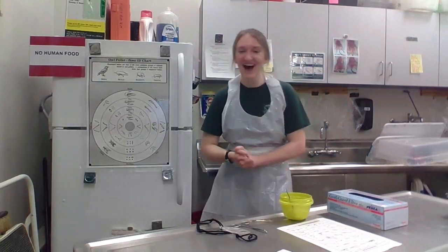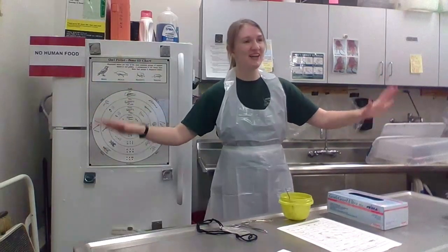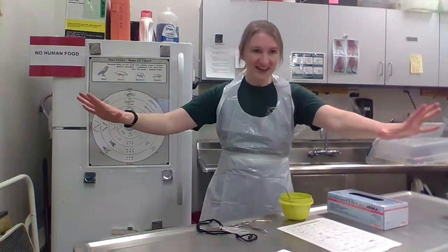Hi, thank you all for being here today. What a great audience. Welcome to the Raptor Center Bird Kitchen Edition. Today we're going to be making something very special — we are going to be making and then dissecting owl pellets.